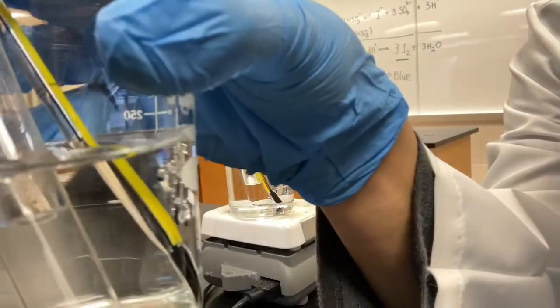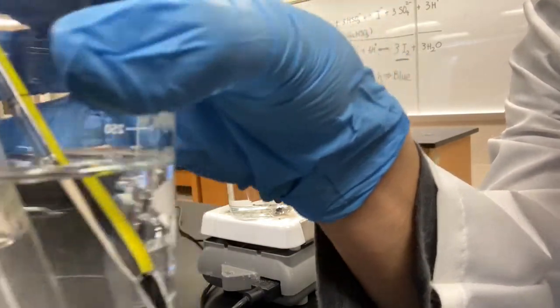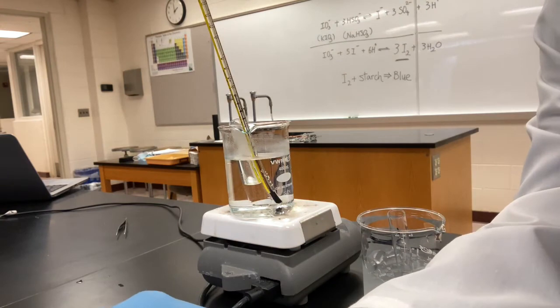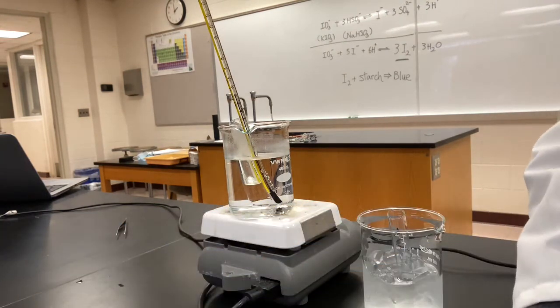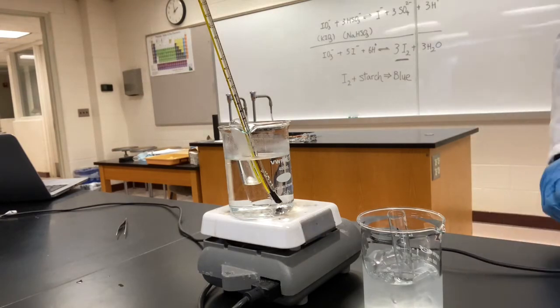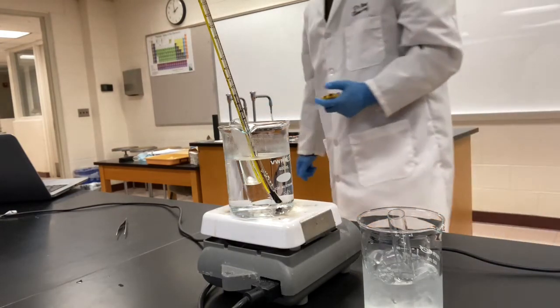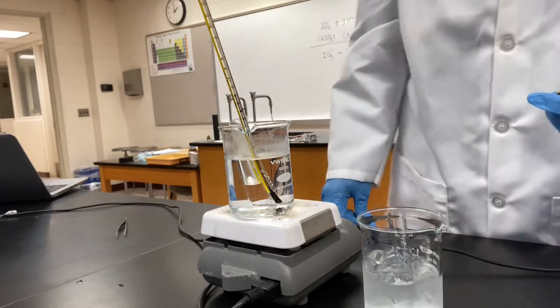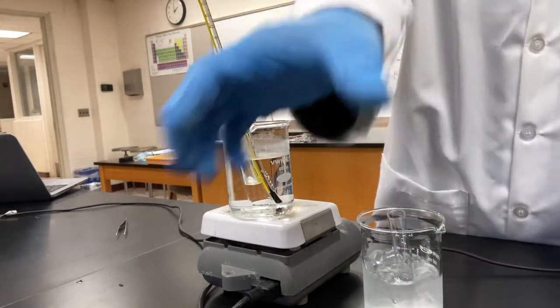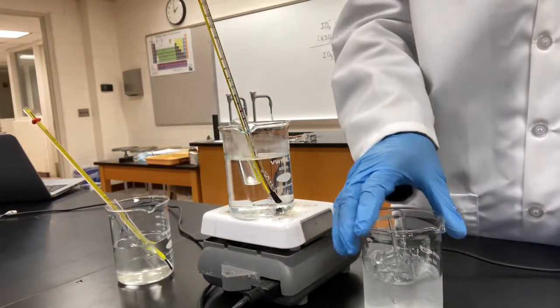All gone. All the zinc disappeared. 2 minutes, 35 seconds. The last one was 38 seconds. This one is 2 minutes, 35 seconds. Okay. 0 degrees Celsius.